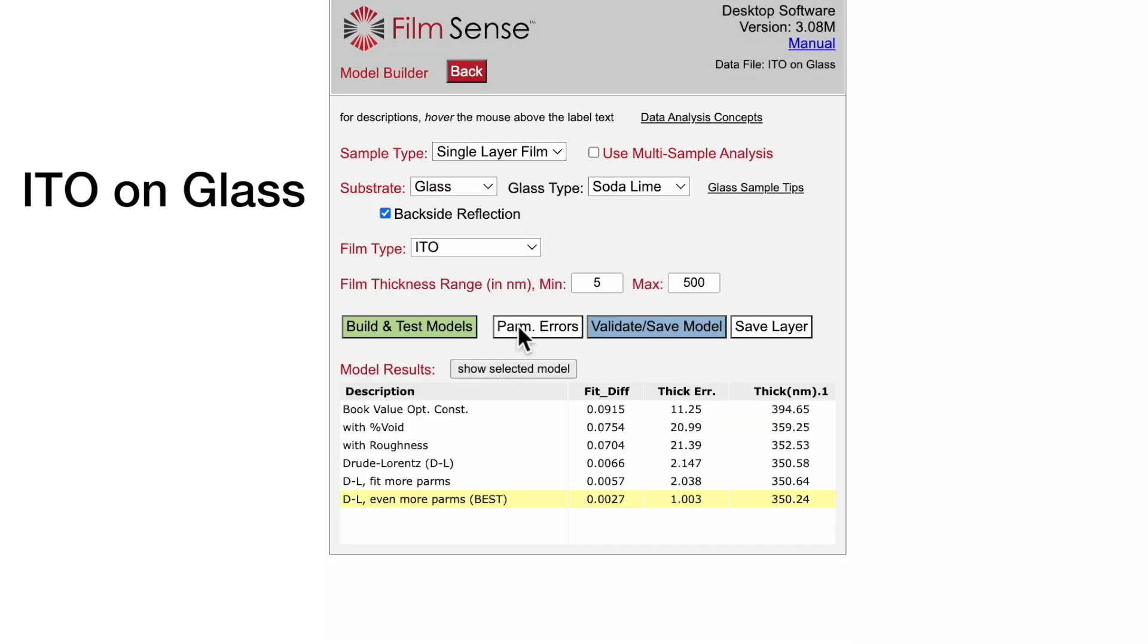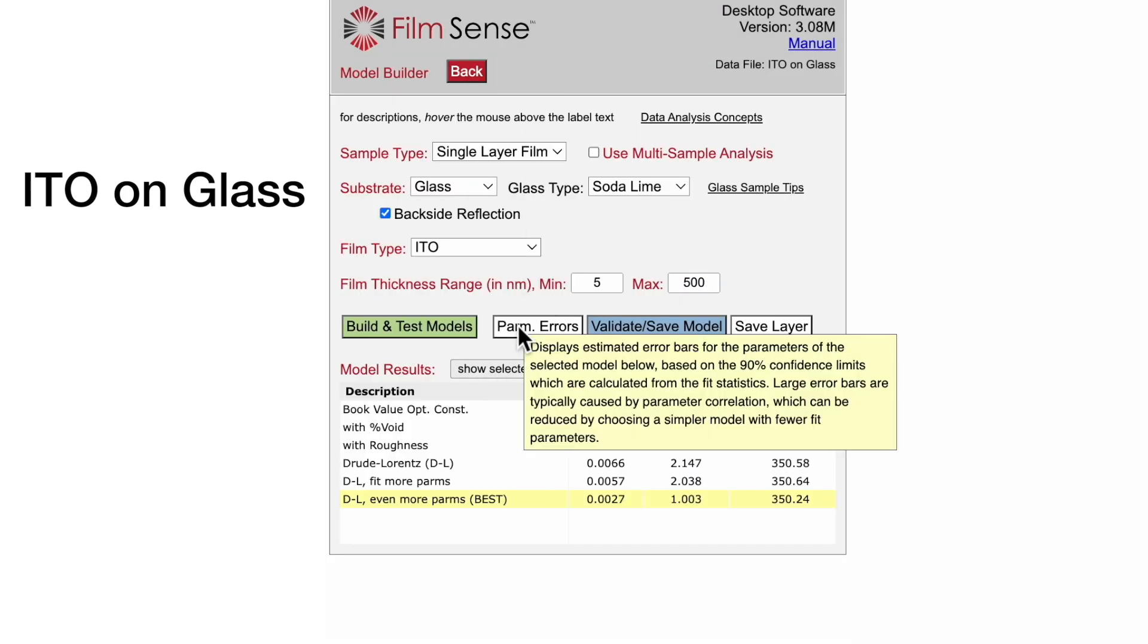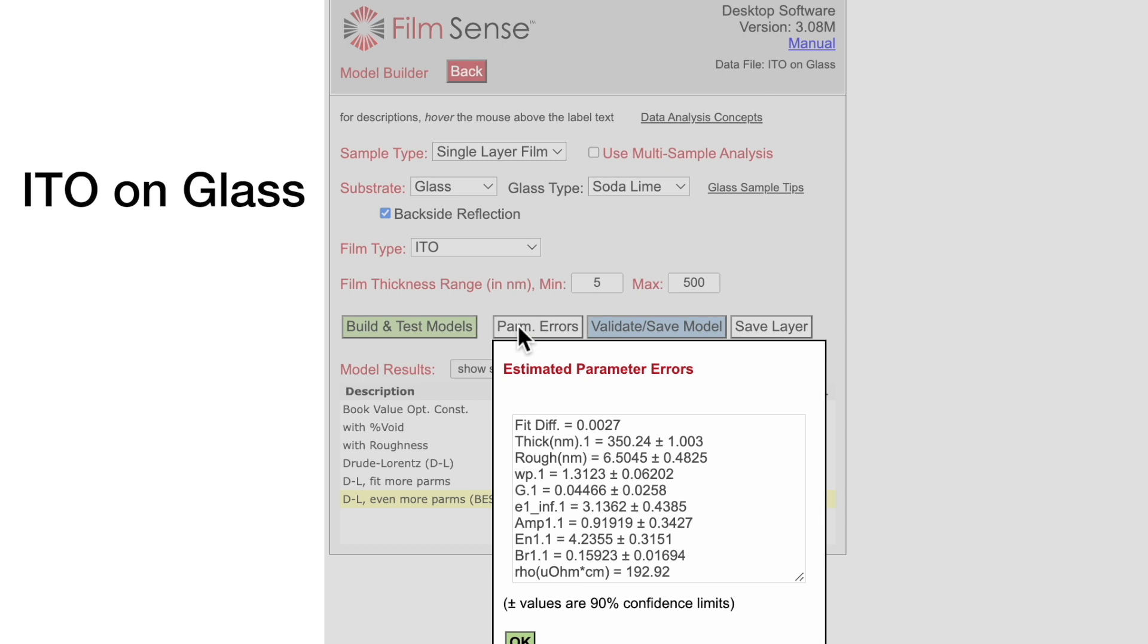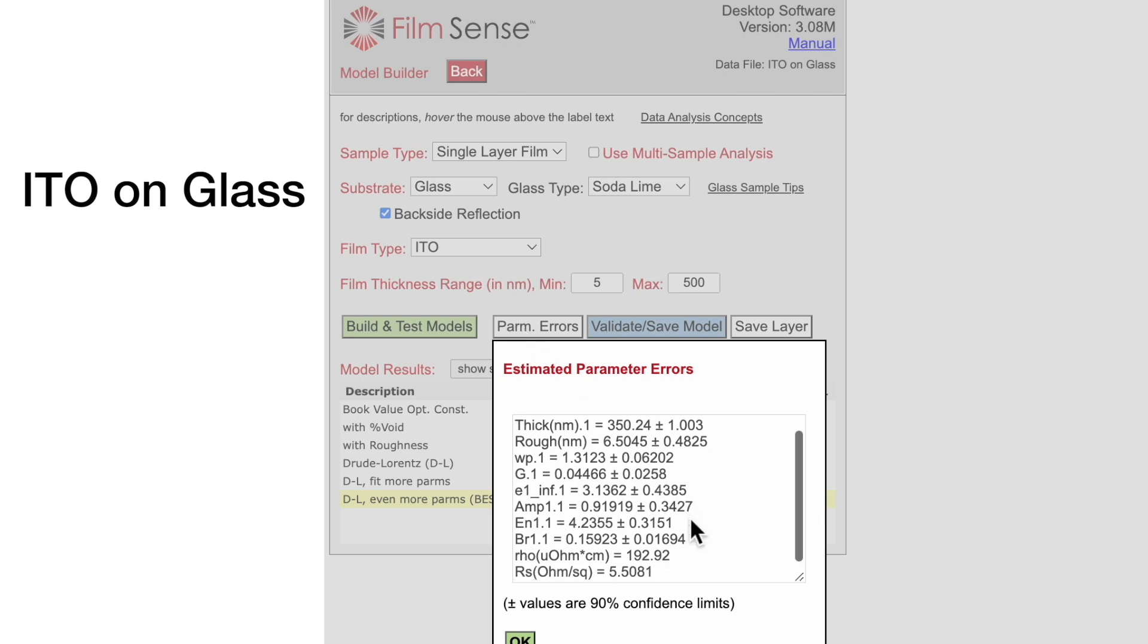Even with fitting for all the Drude-Lorenz oscillator parameters, acceptable error bars are observed. Also note that the Drude parameters can be used to calculate the film resistivity and sheet resistance values, which often correlate well with electrical resistivity measurements.